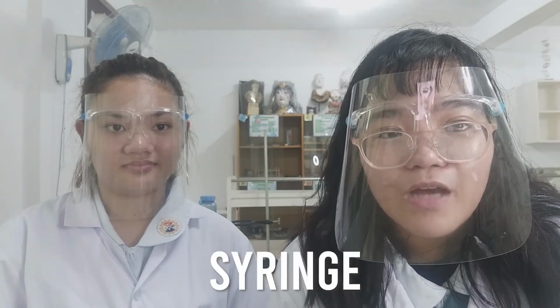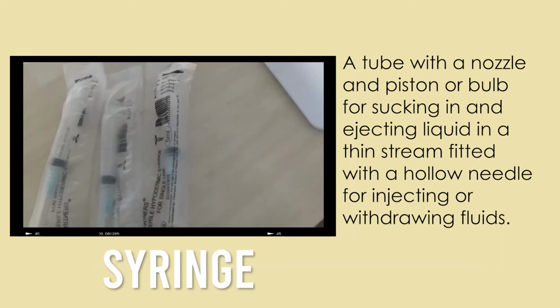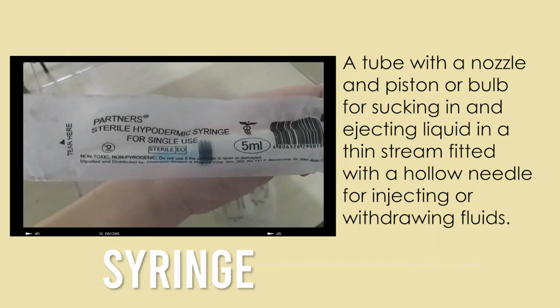Next up on our haul is the syringe. Well, if you would ask me what the syringe is, then I don't think that you would pass the laboratory activity. Just kidding. The syringe is an important lab equipment in the laboratory, for it is used in measuring and transferring solvents and reagents where high precision is not required. We sure are to take note of that, Kim.